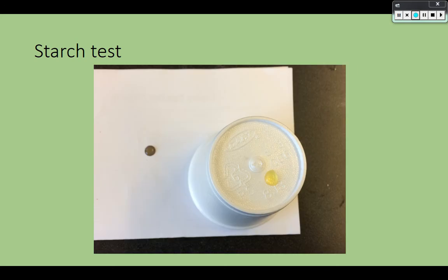One nice thing about the starch test is if I have something solid, like a solid piece of food, say an apple instead of some apple juice, I can actually put 1 drop of iodine right on the substance. So here I put a drop of iodine on a piece of paper. Paper actually has starch in it. That's what gives it the nice white color. They use a starch. And then I put another drop on a styrofoam cup. Styrofoam does not have starch in it. So you see the same result, but I don't have to liquefy it or anything like that. So the dark brown color is starch. The light yellow color is no starch.